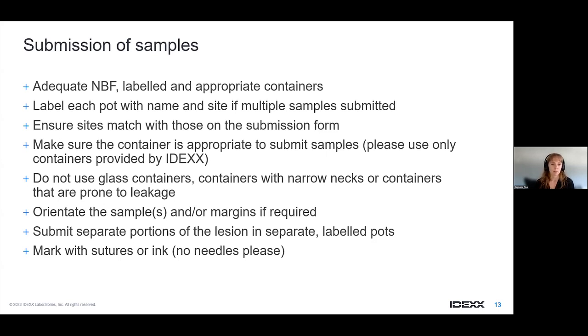Yes, I've already said about the margins and the orientation of the sample. And if you want to submit separate portions, then it's also very helpful to have them in separate and labeled pots. If you want to ink or mark the samples for whatever reason, for example, you want to mark the dorsal, the ventral, the cranial, and the caudal margins, then it's really helpful to use sutures.